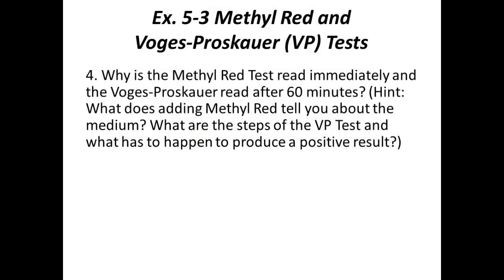So why is the methyl red test read immediately? It's just a pH test, right? But the Voges-Proskauer, right, you don't read it until at least 60 minutes have gone past, because what has to happen? A chemical reaction, right?